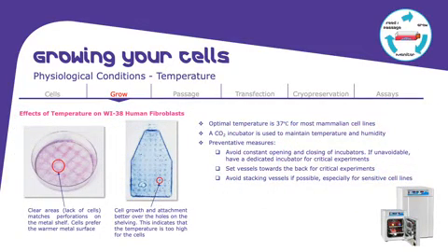Make sure that your cells feel comfortable and that the temperature in the incubator is optimal. As you know, the optimal temperature for mammalian cells is 37 degrees. I previously mentioned the CO2 level is also very important, and in that case you will see changes in the color of the media.